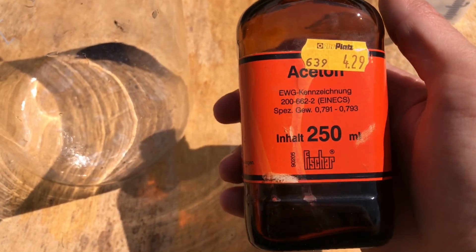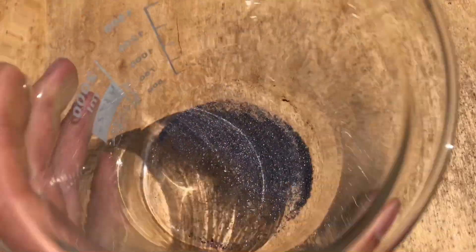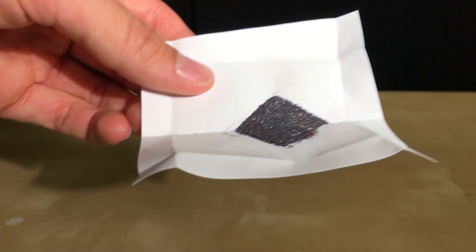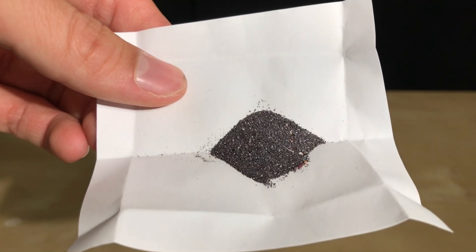Then I added acetone. But why use acetone? You could simply perform a vacuum or gravity filtration. My vacuum filtration setup is currently being used and I didn't want to perform gravity filtration. When you use acetone, it dissolves most of the water which can then be decanted off, and acetone also evaporates extremely fast.